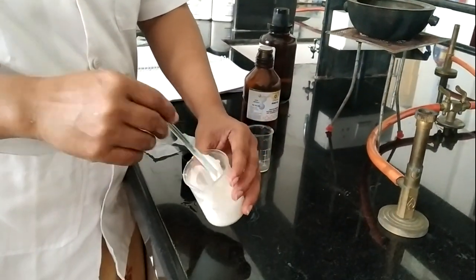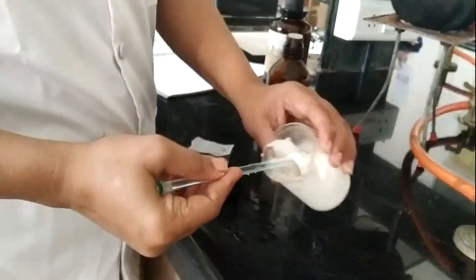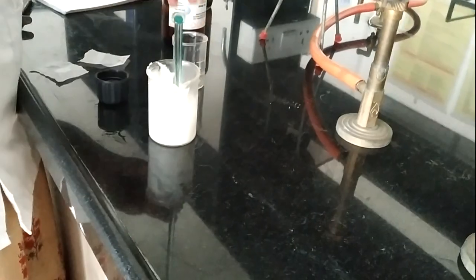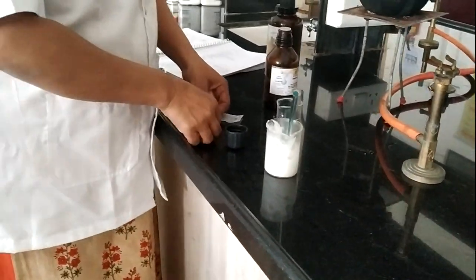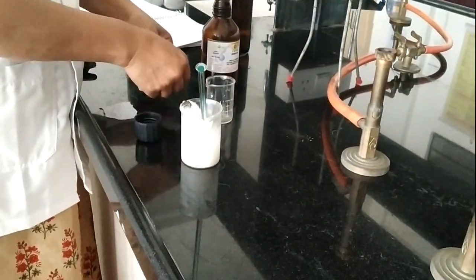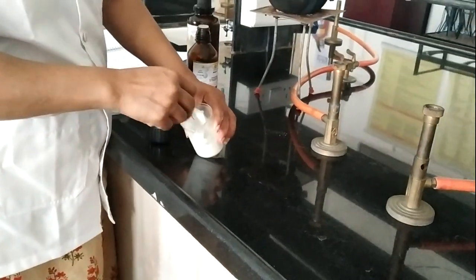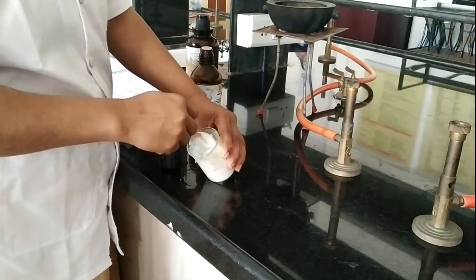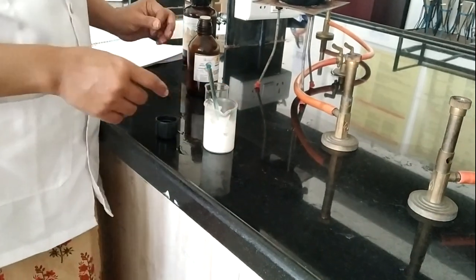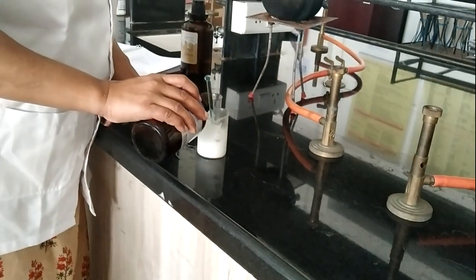Our cream's texture is white and non-greasy, and its pH is between 5 to 8. In this we add methyl paraben and propyl paraben as a preservative. Perfume quantity sufficient. Here we add rose oil as a perfume.